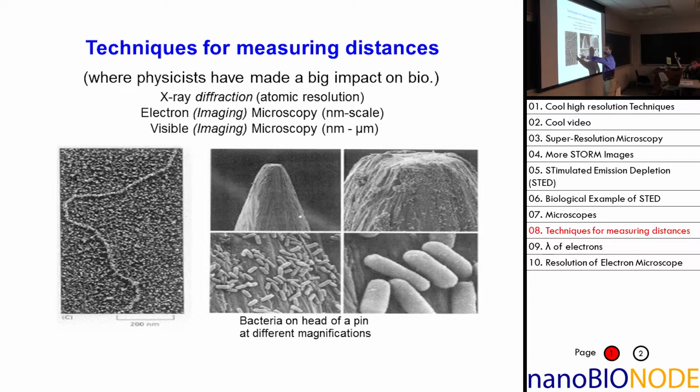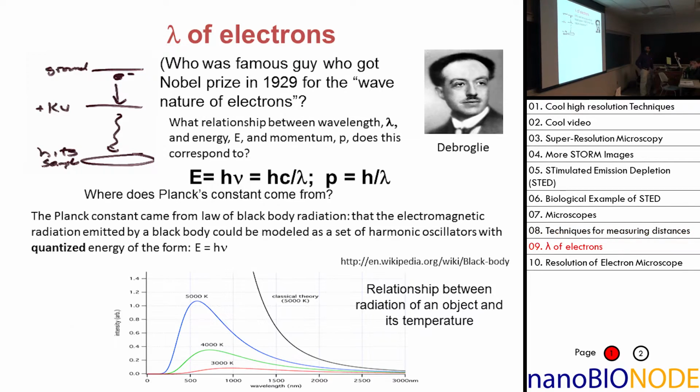And this over here is an individual DNA molecule with this size is 200 nanometers. So you can see just a few nanometers. Okay, so let's actually figure out what the resolution, what is the lambda. And so you get lambda over 2 if you have diffraction limited resolution.